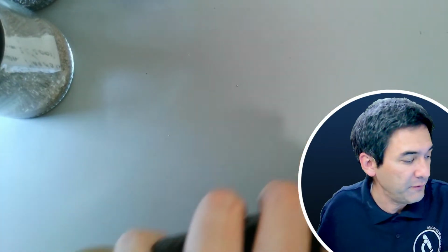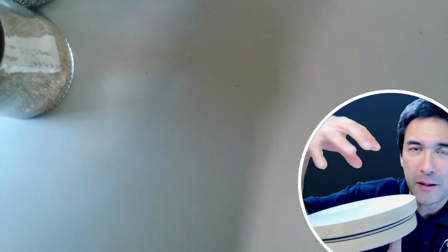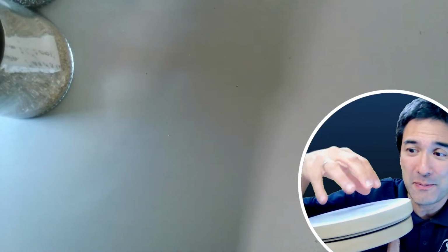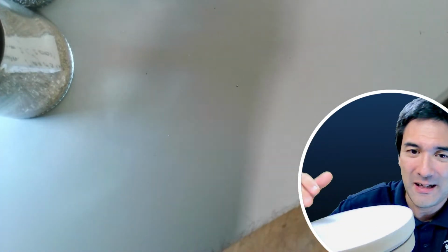However, there are of course also homemade solutions. Look what I found here. I also have to show it to you. It's made of, I don't know, wood. It also has this spinning platform, and this is used by people who make pottery with clay, because they're spinning this and making little dishes and cups and vases. I bought this actually for demonstration purposes, so I can put a microscope on here and rotate it to show all of the different sides.